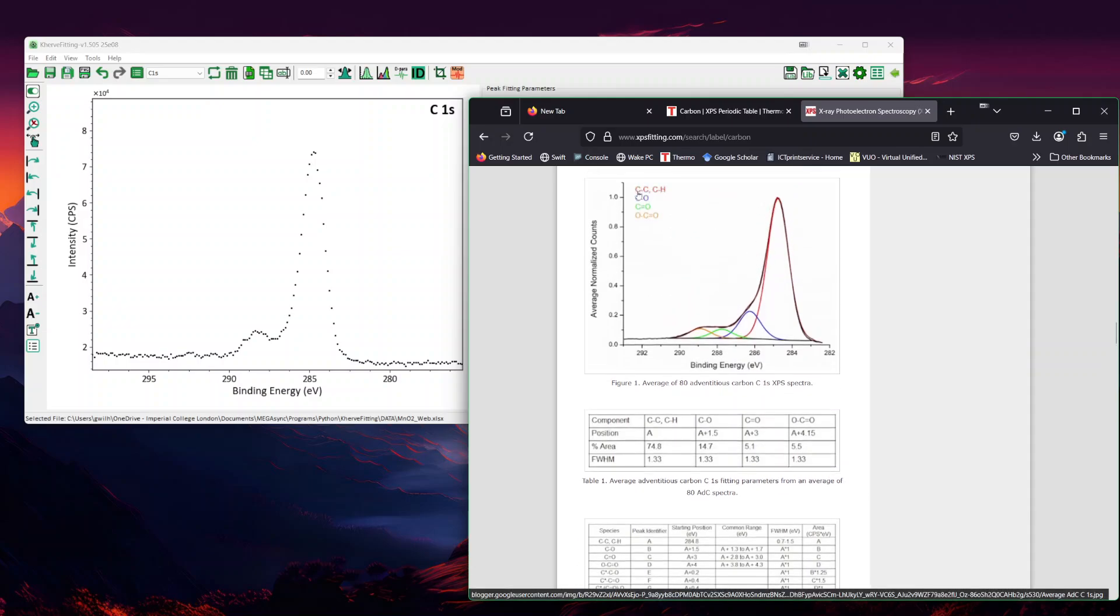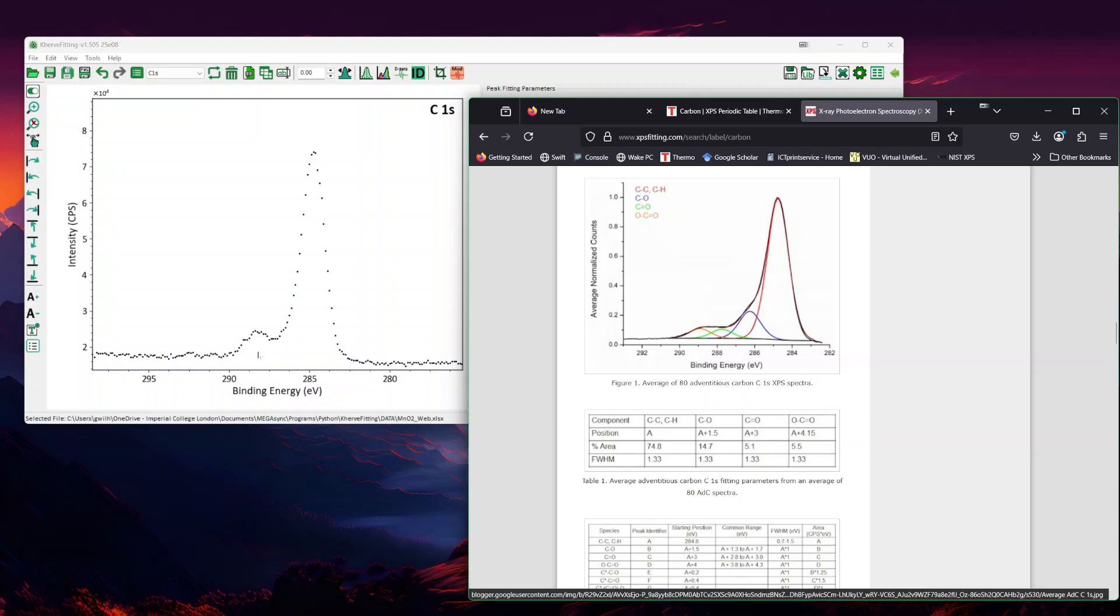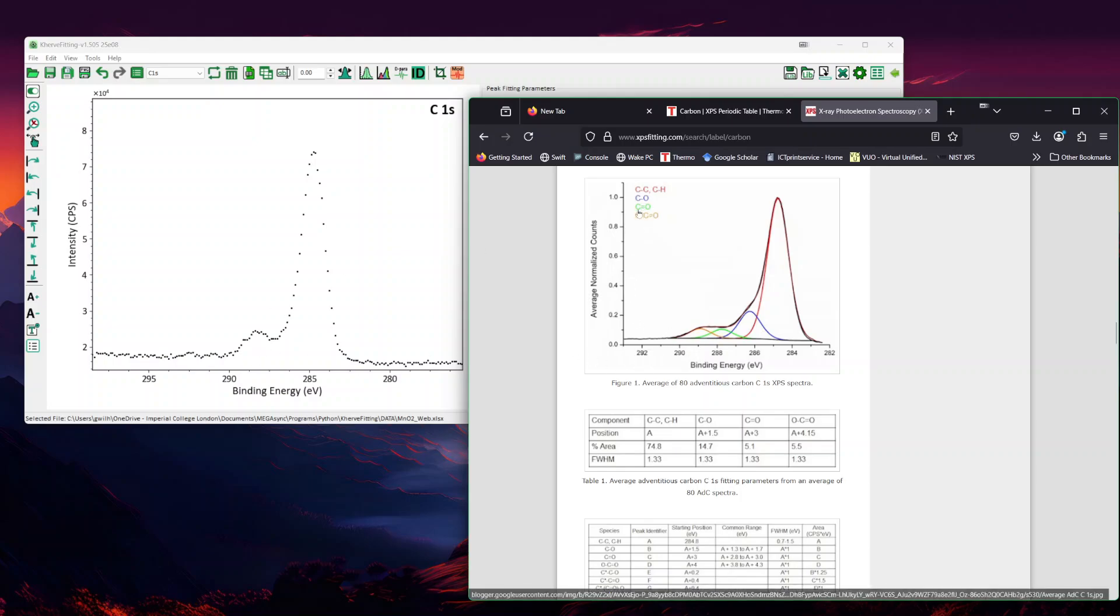Now we expect here maybe around three to four peaks. So we expect the C-C, the C-O, the C double bond, and if it's well resolved, we may see the C double bond and then the O-C double bond.